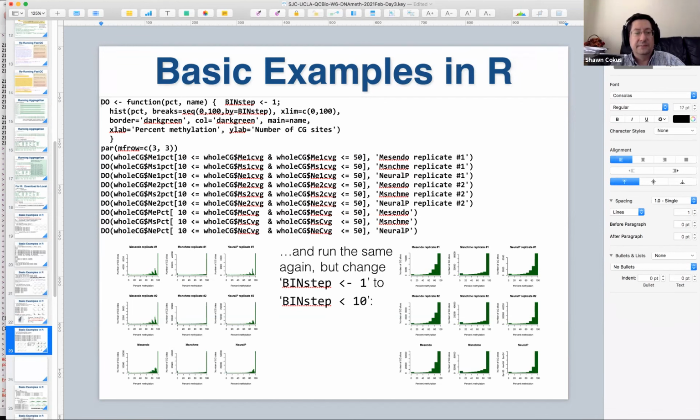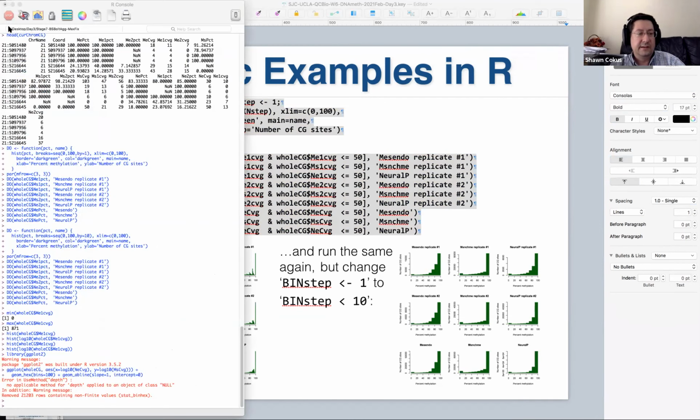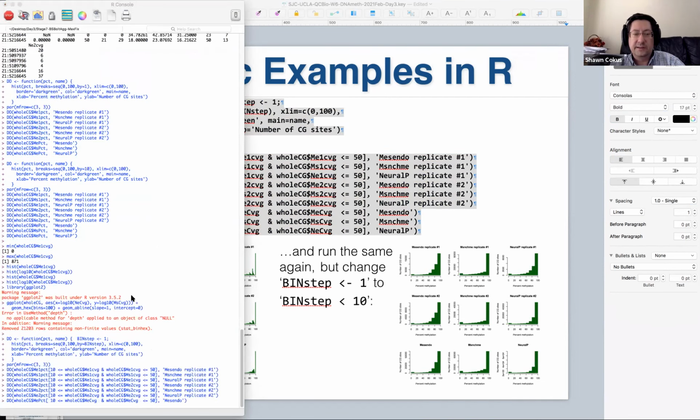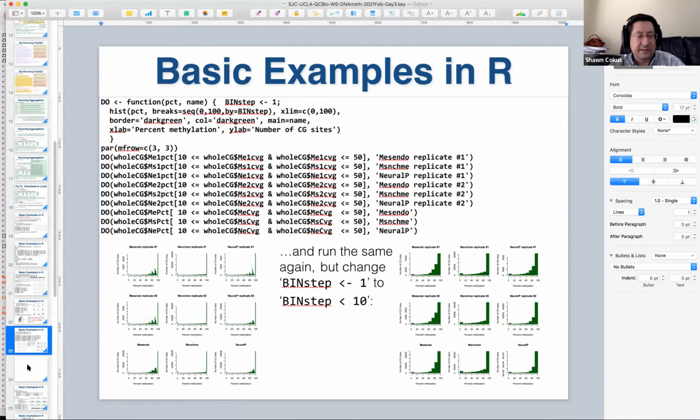So, you can copy and paste this in, and this will give you this sort of coverage subsetted specialized plots here. And you can actually see the pooling now. Maybe these histograms are sort of cleaning up now. They're looking a little more continuous and so on. It's because we're dealing with denominators that are a little more controlled now. We're losing sites to do this, but the denominators are kind of acting more reasonably. Okay, so that's kind of how that goes.